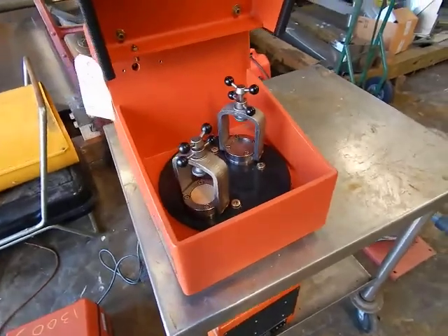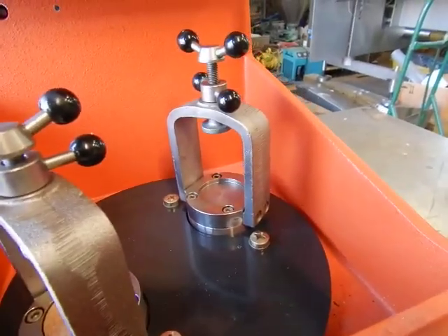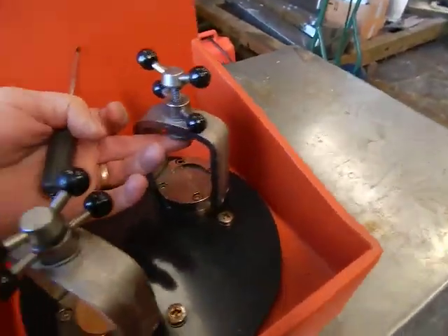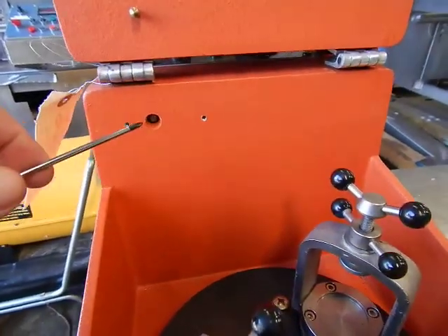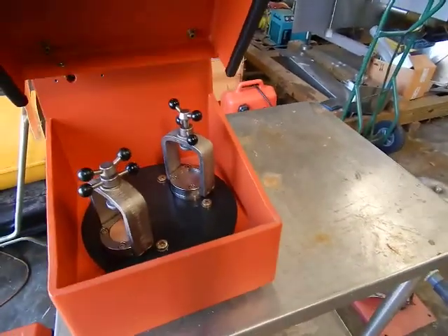The stations hold a small container, as you can see. They're in place and have a small button head with a non-marking material on top. They clamp in place. Right here you can see there is a safety device — we're going to trigger that later for you.